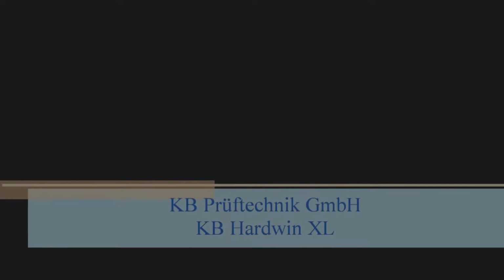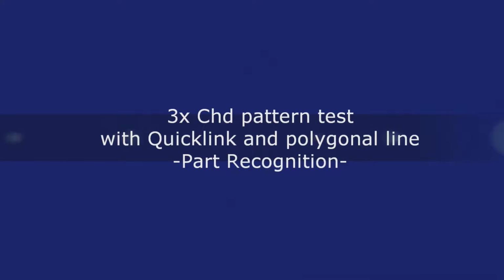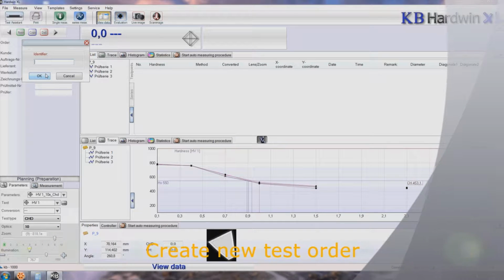Welcome to KB Prüftechnik. In this video we show you how to use KB Hardwin XL to create CHD patterns quickly and easily. First, create a new test order. The designation can be freely chosen.